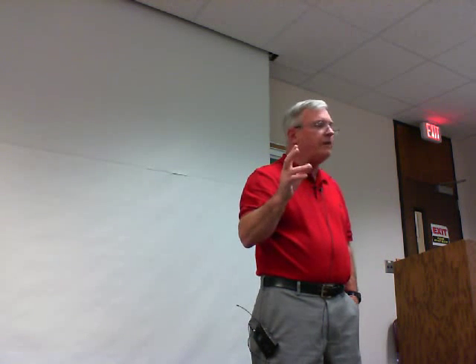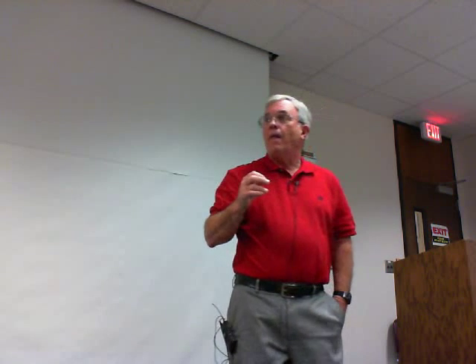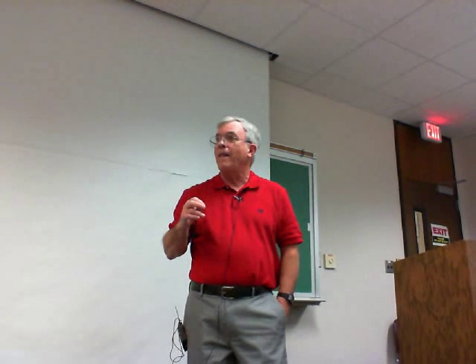Fine focus, you can move fine focus. That's probably all you'll need to use. And this is probably stupid, but you want us to stay at our station until the time goes off and then move, right? Right.